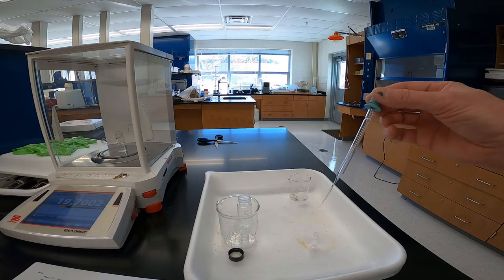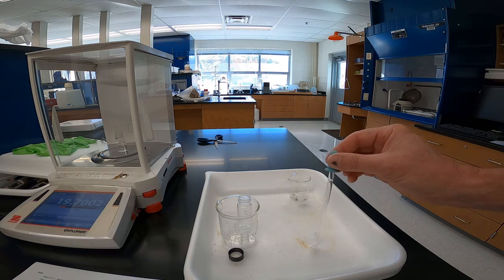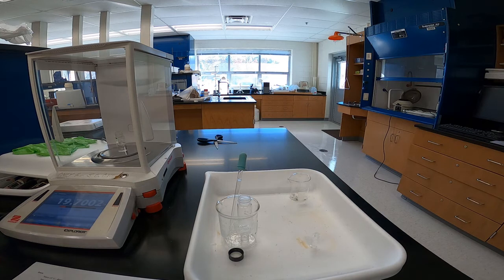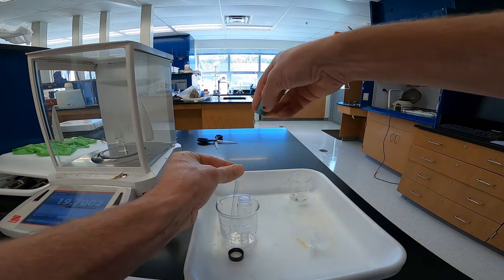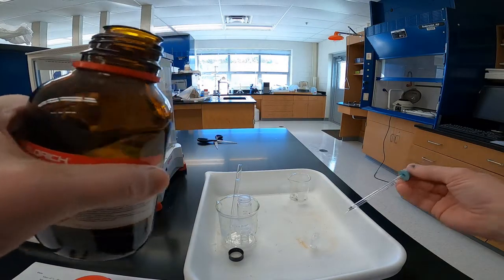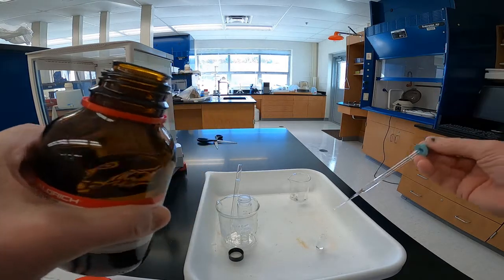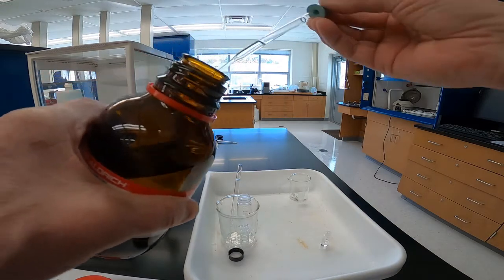So all I have in my capillary here is a very tiny amount left. It doesn't even take but just the smallest of drops of product. So that's probably even way too much in there. So then, to prepare our sample for the mass spectrometer, we dissolve it in hexane. So I'm going to use a new glass pipette and add solvent hexane. Usually add about a milliliter.